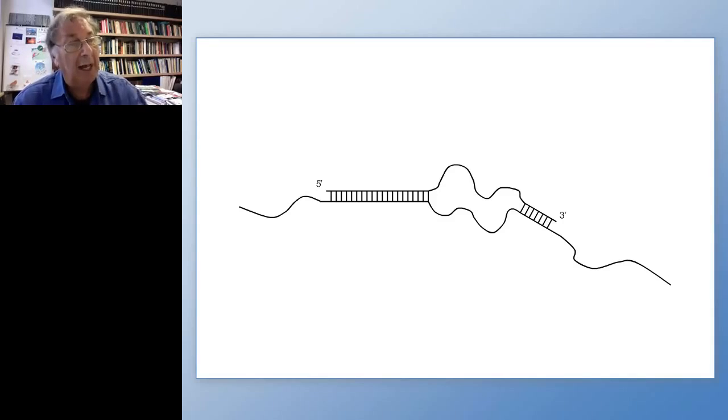And the special aspect of these primers to remember is they're very poor primers. The feet form very, very weak hybrids. And that's the key to their selectivity.